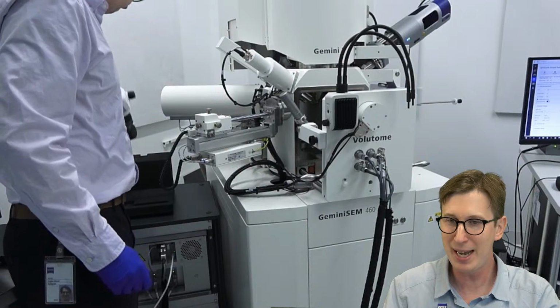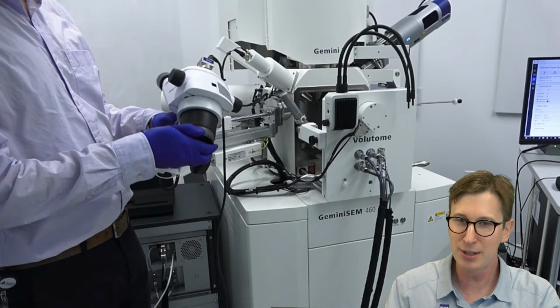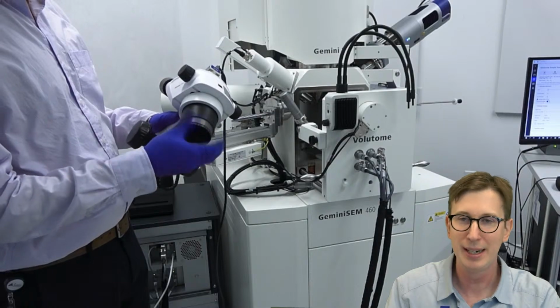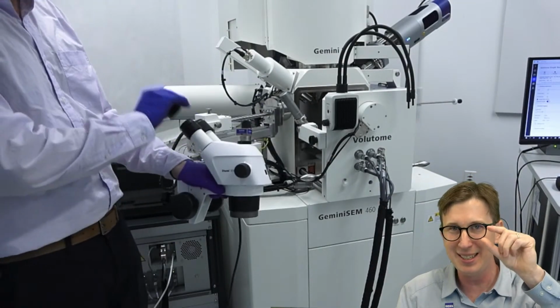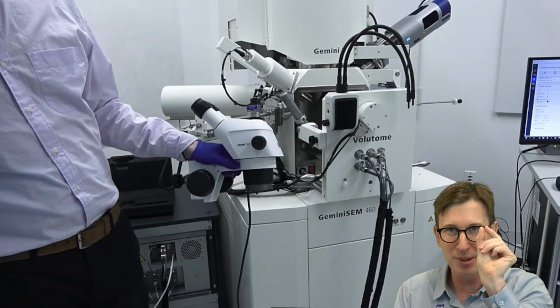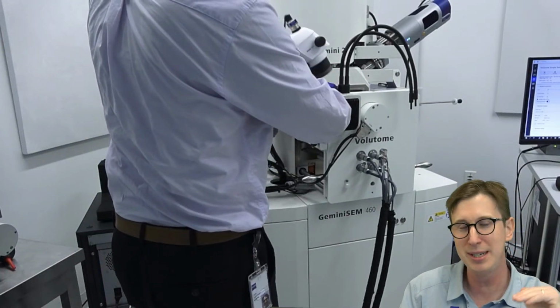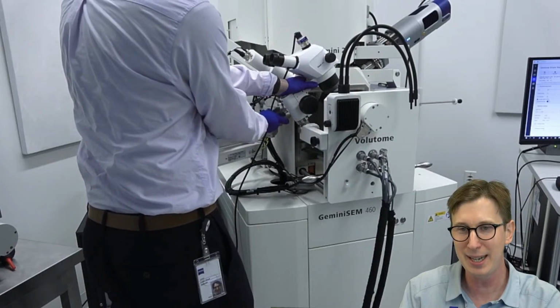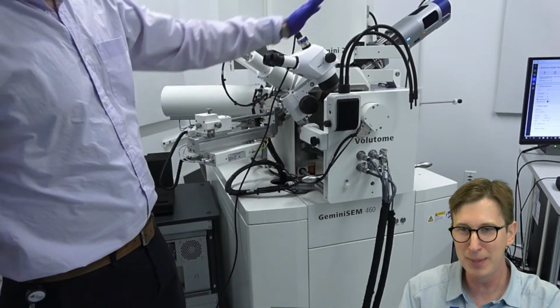And I want to point out that this has a camera on top as well. So this is going to let us, through the software, get a view of what's going on. Because remember, the sample pin is coming to a point. Our sample is about 1 millimeter wide, and I'm going to need to approach the diamond knife that is inside of the chamber. So this really helps me do my job.